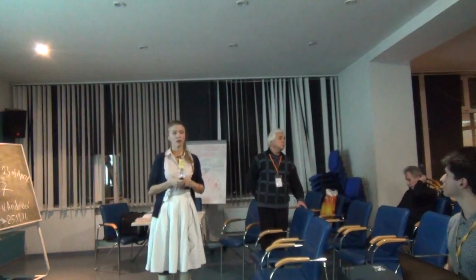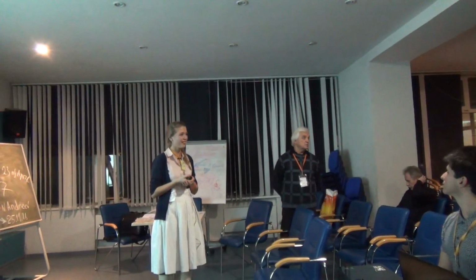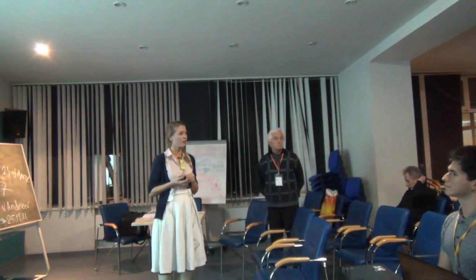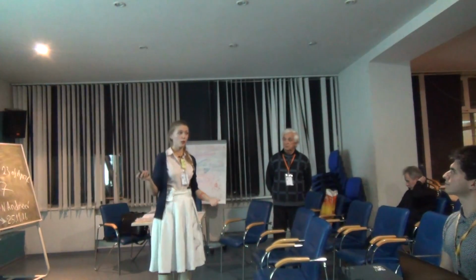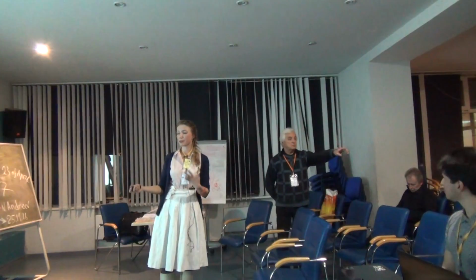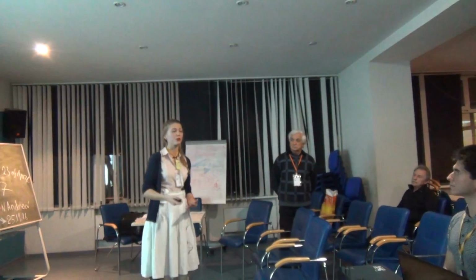Тоже мышка, и там копили часов 5. А здесь всего 10 минут. Ну, наверное, поэтому. Тогда малоинформативный. Тогда какая же концентрация определена? Я концентрацию определяла по in vitro спектрам, по вот этим красивеньким. In vivo здесь я просто показываю, что дальше возможно перейти от in vitro спектроскопии к in vivo, и что действительно спектры хорошо отражают друг друга.